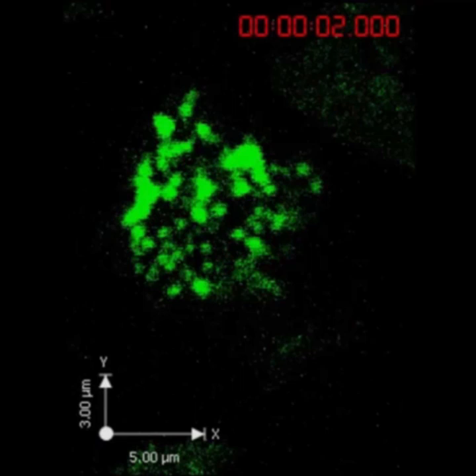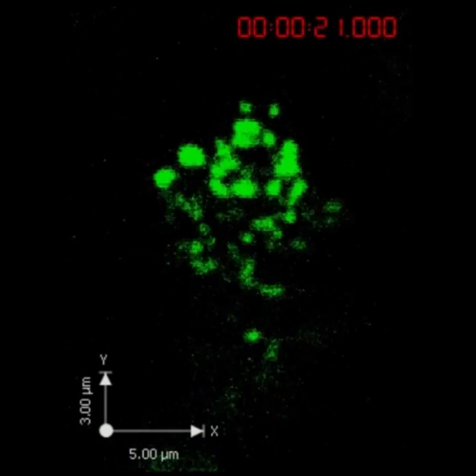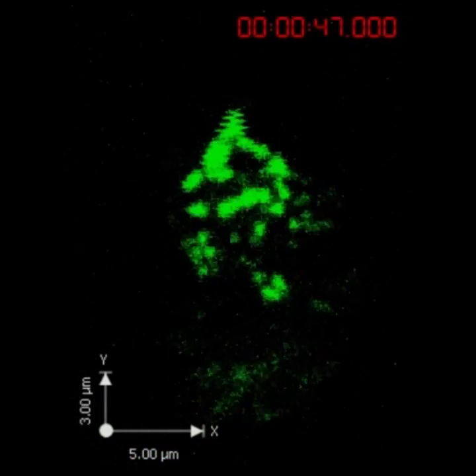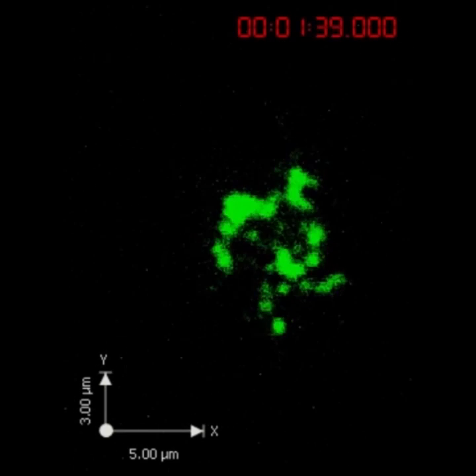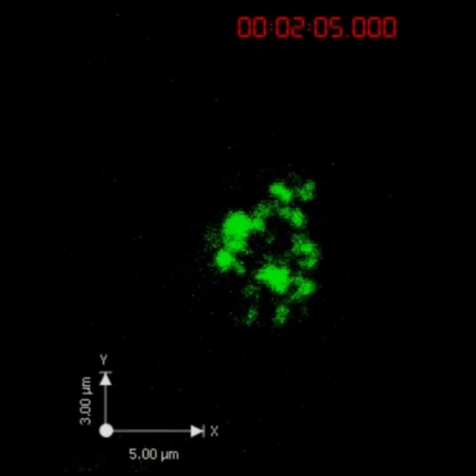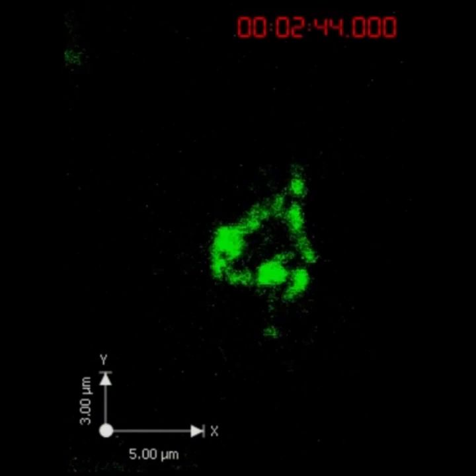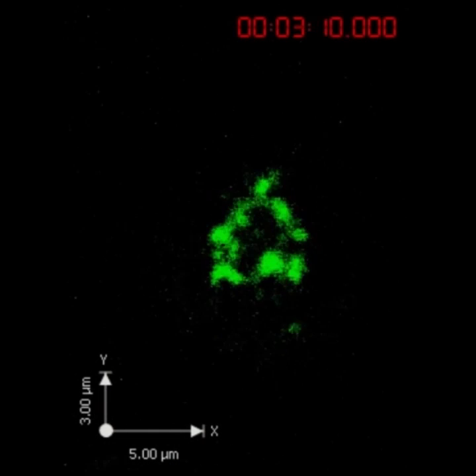If we look at the clip, these clusters then dramatically move around very rapidly and within a few minutes start to move towards the center of that NK cell-diseased cell interface where they form this really distinct and obvious ring structure. This ring structure then remains throughout the contact.